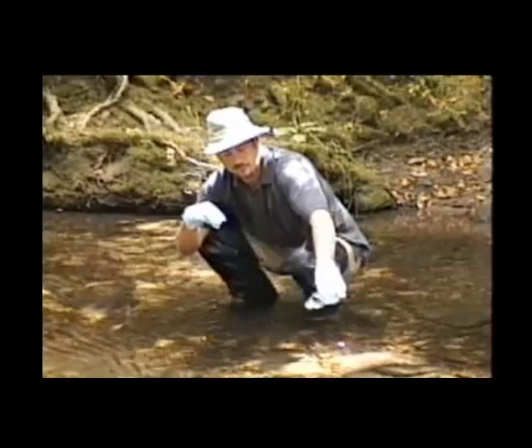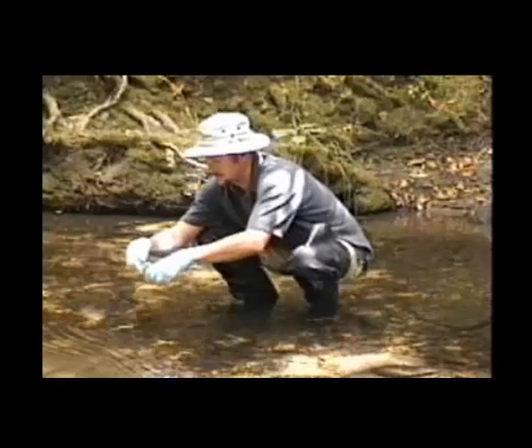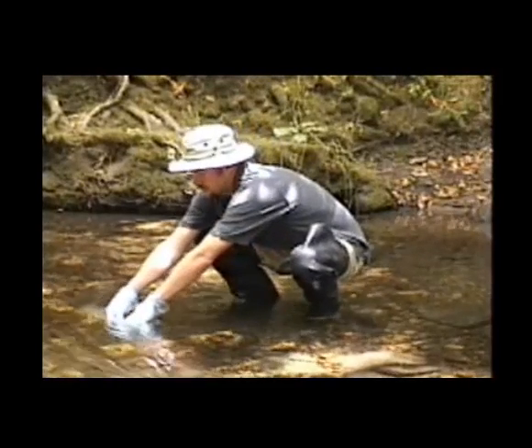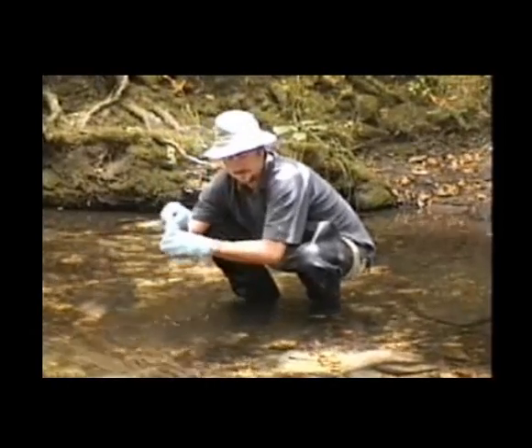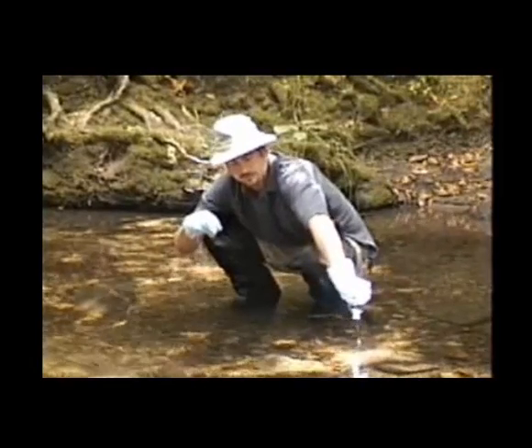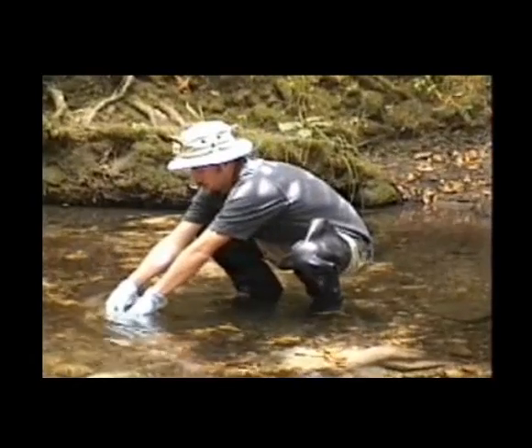Again, this is repeated a 3rd time. Again, the container is capped, removed underwater, the bottle allowed to partially fill, the sample bottle is agitated to get a really good rinse, the rinsate is poured downstream, the sample bottle is again capped, placed underwater, the cap removed, and now the sample is collected.